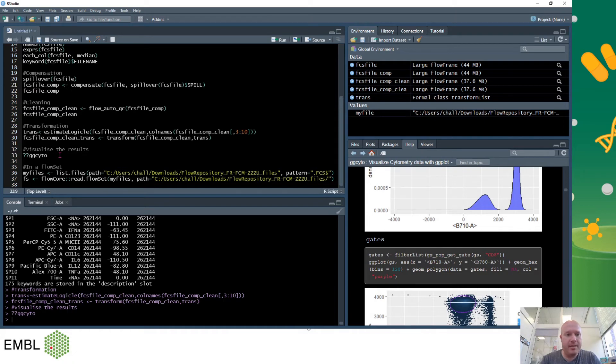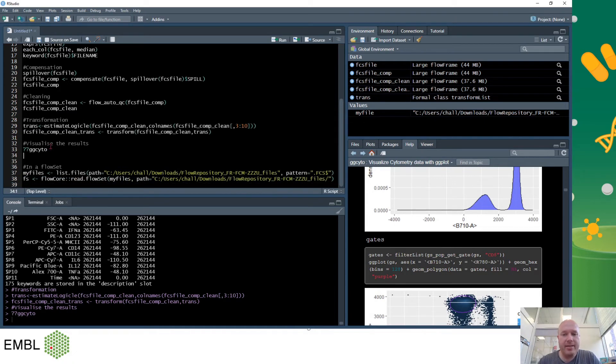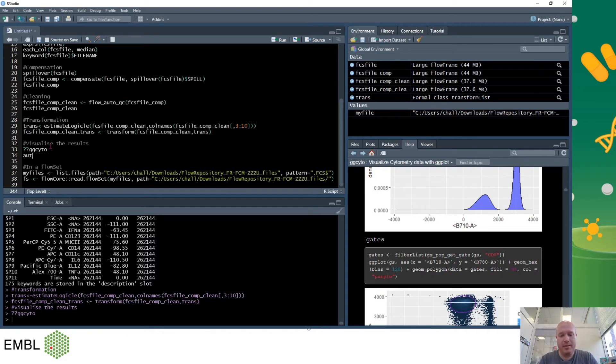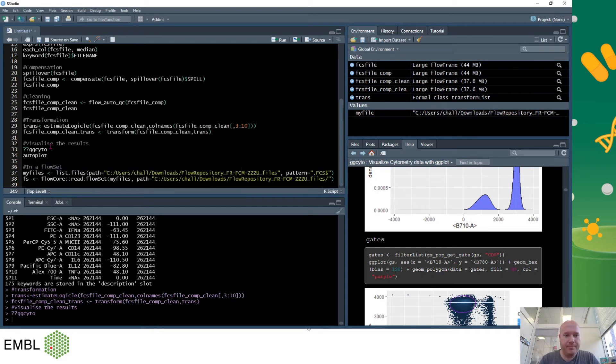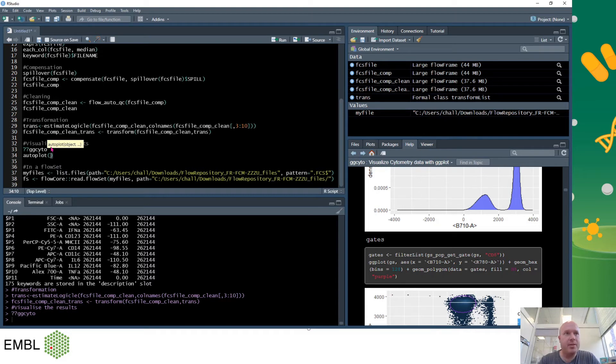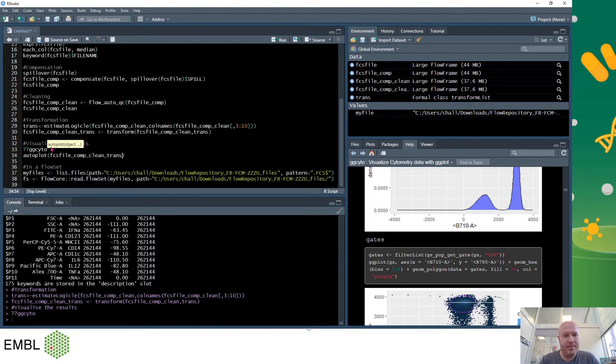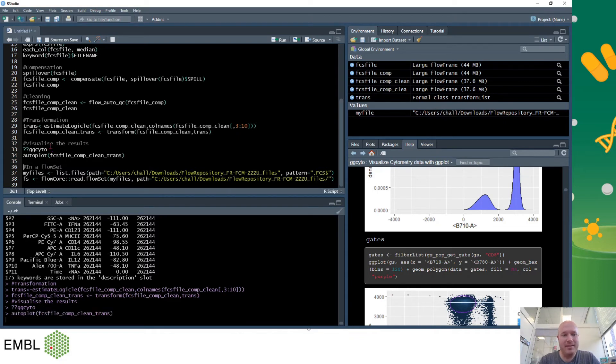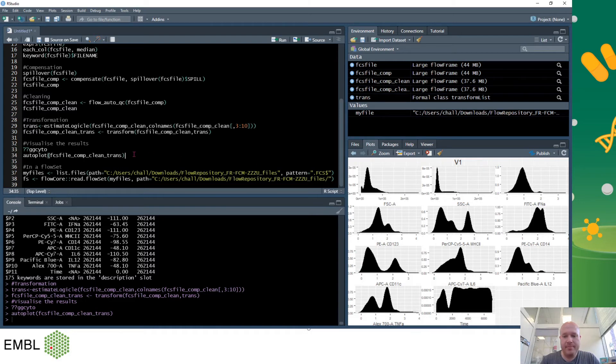So auto plot guesses at all the parameters you want to show. So if I type in auto plot and then fcs comp clean trans and press ctrl enter, it will produce a plot on the right hand side with all my expression data and histograms because it's guessed that's what I want to see.